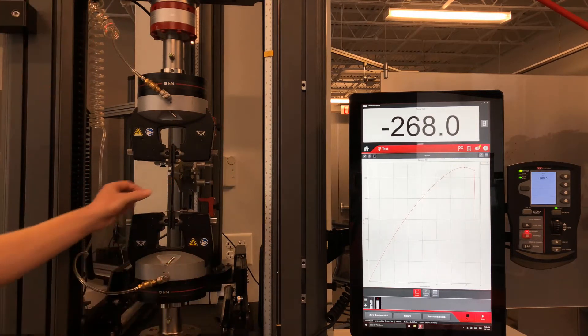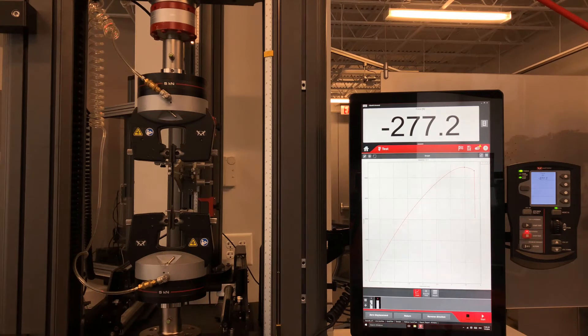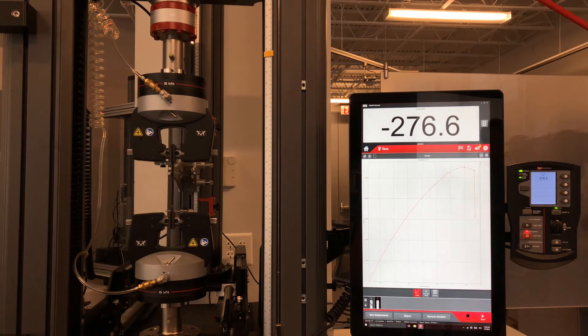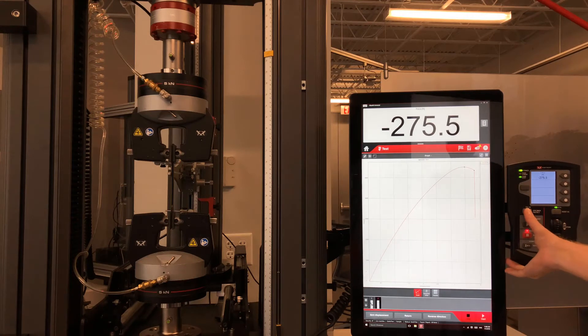As seen here, a rigid plastic specimen has been loaded into the set of grips and upon closing them, a compressive load of nearly 300 newtons is seen.